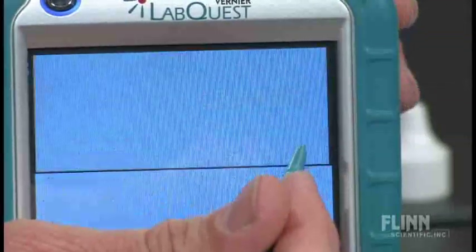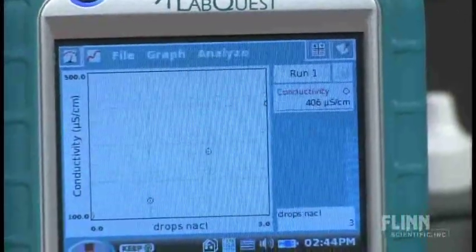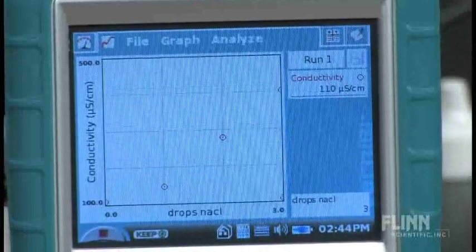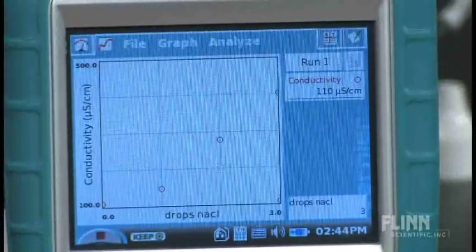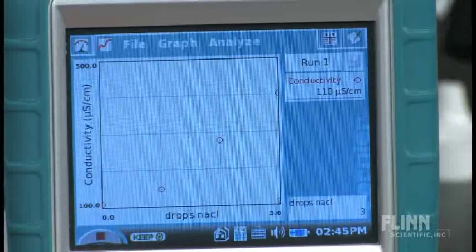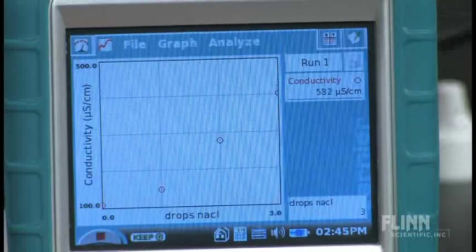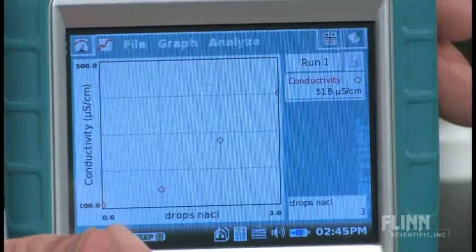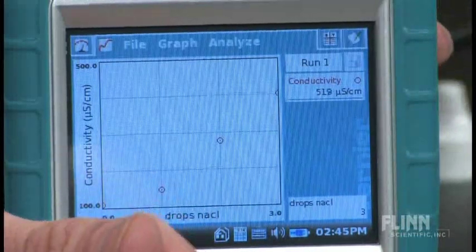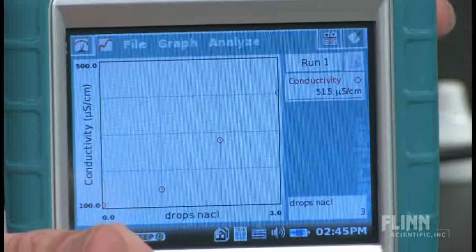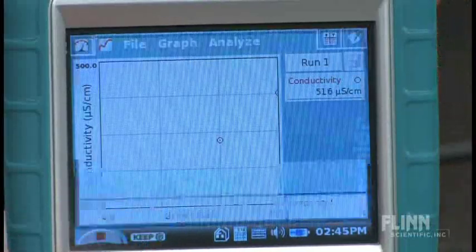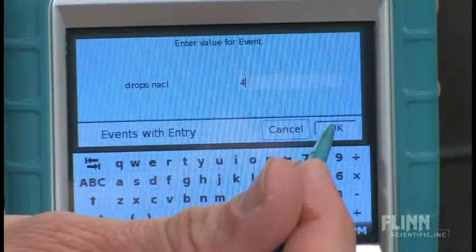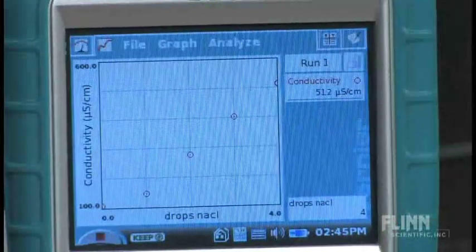I've got to get that one in there. We can see it building a very nice graph. One more drop, please. And give that a swirl. It should be a relatively linear graph. And we'll keep that. That is a total of four drops of sodium chloride that we have there at that point in time.